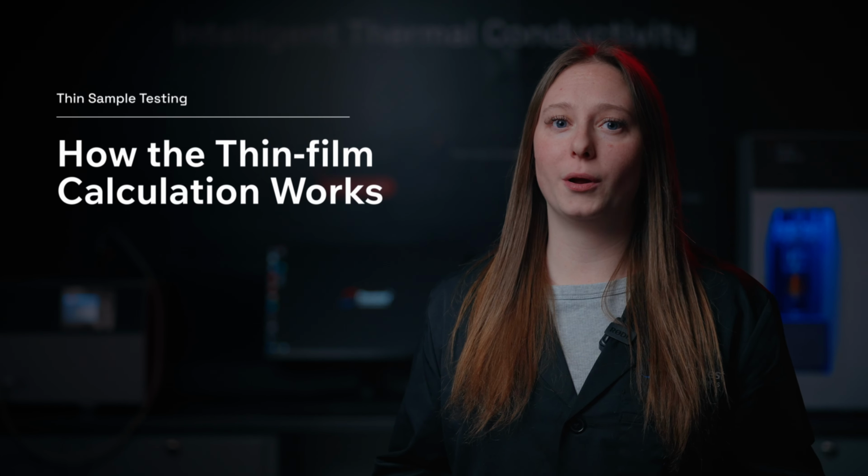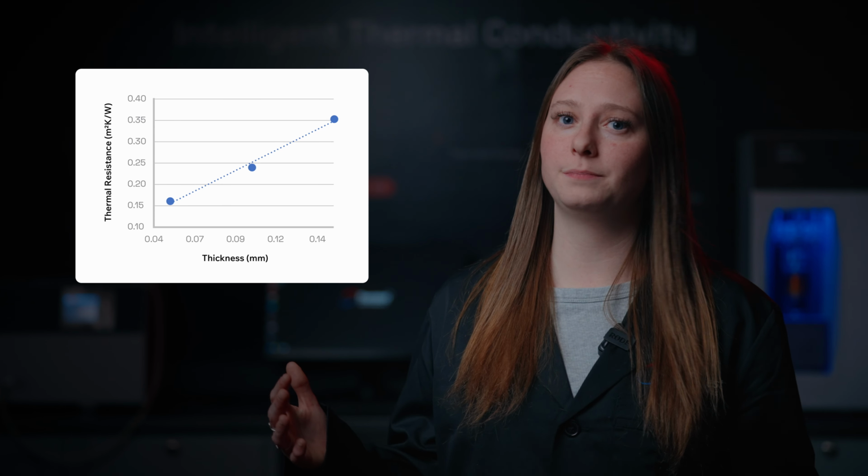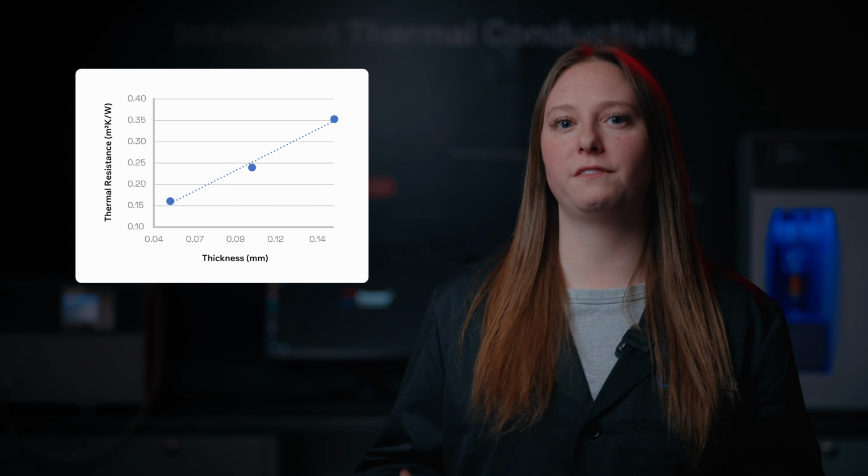The calculation model works by stacking multiple identical film layers and measuring the thermal resistance as that stack grows. That resistance increases linearly, and the inverse of the slope gives you the film's effective thermal conductivity. This approach is especially powerful because contact resistance between the sample and the backing doesn't dominate the final conductivity result, which is often the biggest challenge when testing thin films.